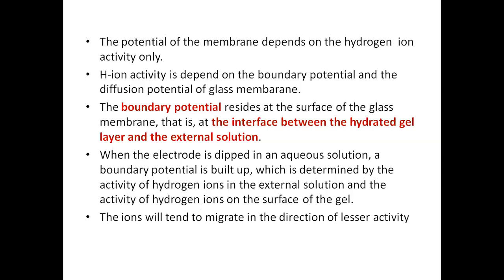So the same thing happens here when these two solutions containing hydrogen ions at different concentrations are in contact with each other. The ions will tend to migrate towards the side of lesser activity.